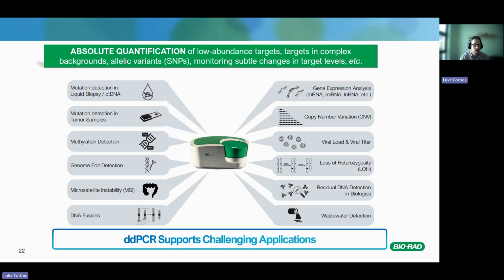Copy number variation is obviously not such a problem for small copy number changes, but when looking at large copy number variation changes, real-time PCR can no longer accurately determine the differences because you're looking at a doubling each time. So if you're working between cycle 32 and cycle 33, it's hard to determine if you are accurately determining copy number when going between such high copy number states.